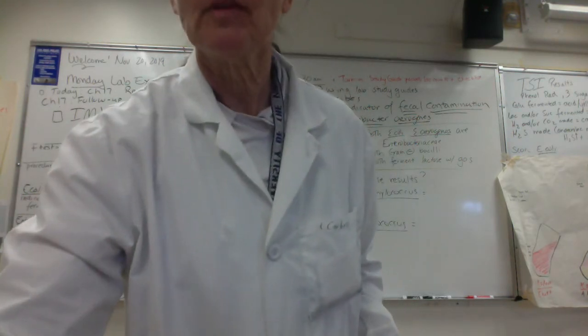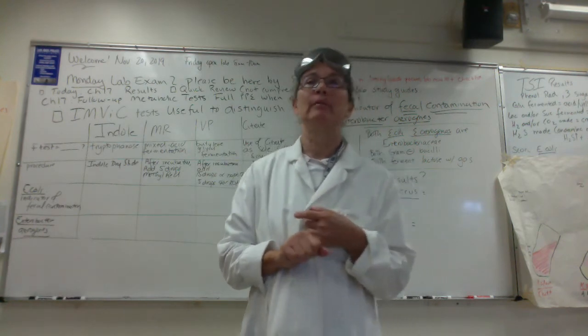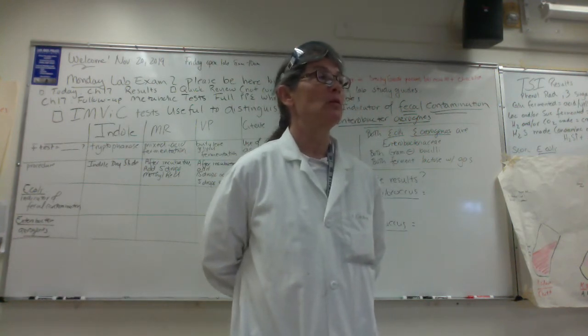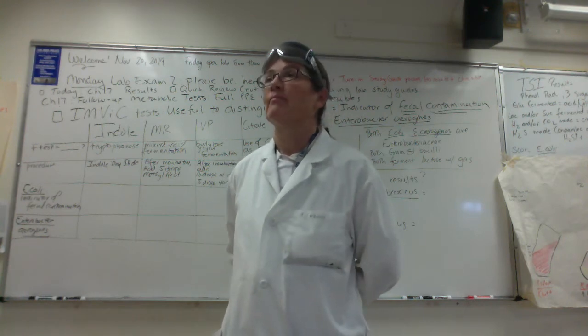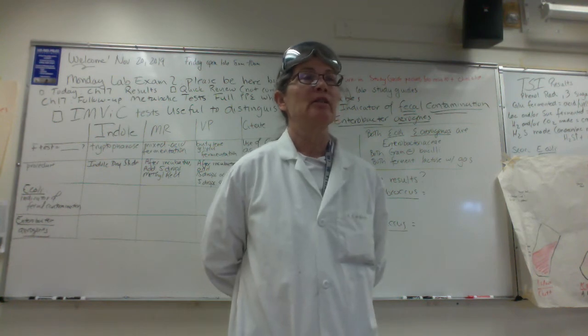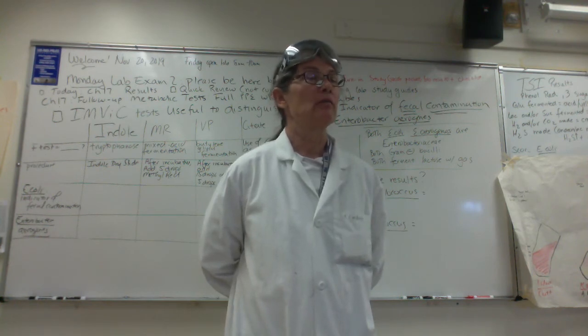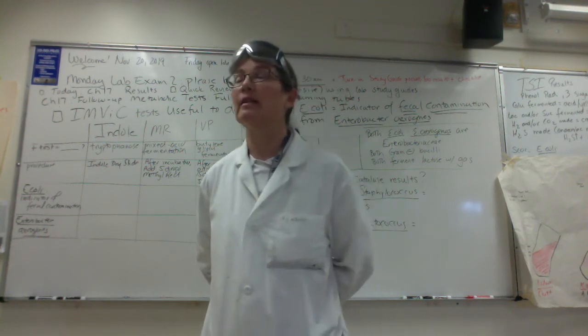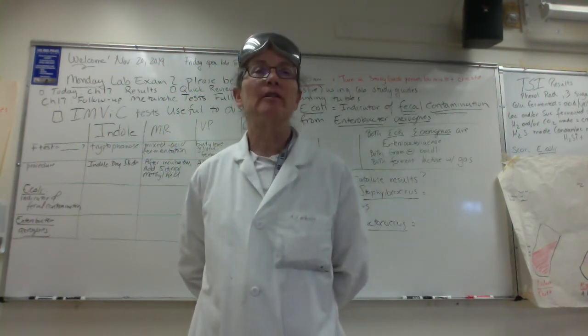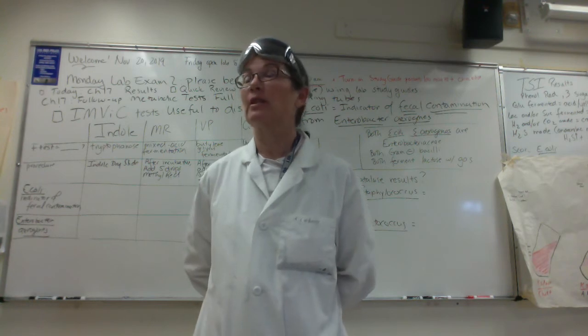Good. Folks, what does the V of IMViC stand for? Voges-Proskauer, and this is a test for, it's a big name, you guys, butylene glycol fermentation, also known as 2,3-butanediol fermentation. Now, I'm going to run that as a demo because the reagents are really toxic. But the procedure is similar to the MR test.